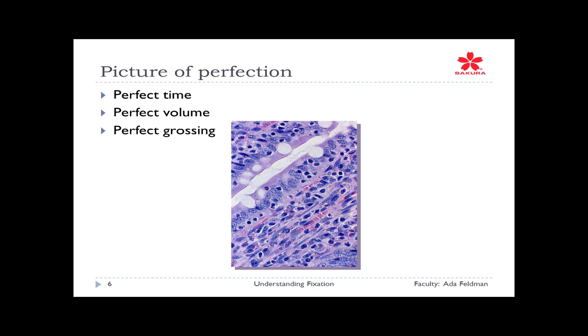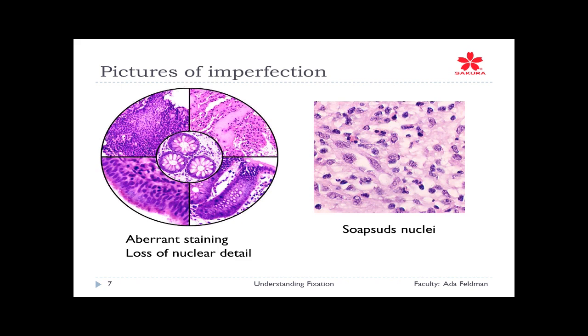If you know your histology, you can see in that gap area, this being intestine, you can see the microvilli. The red blood cells are nice and sharp. The cytoplasm of the cells has the alternative color. This is perfect fixation, all right? That came about because we fixed long enough, put it in a large enough size container, and it was grossed so that the fixative could get in there.